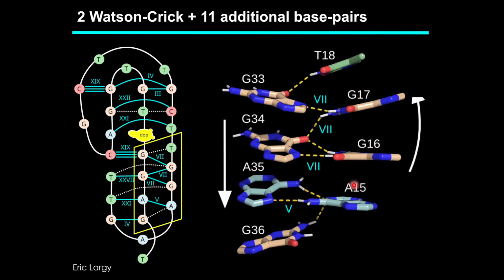So already that's different than expected. This is my favorite part of the molecule, I think. At the back here, you have what looks like they could be very nice base triples, but actually none of the bases on this final strand here are planar with the two other ones nearby. So if you look here, it's a very zipper-like effect. And it's really nice, in my point of view, very satisfying that all of the hydrogens are hydrogen bound to nitrogens nearby and oxygen. So it's fully satisfying the different hydrogen bonds that you can make, but it's staggered as it goes down.